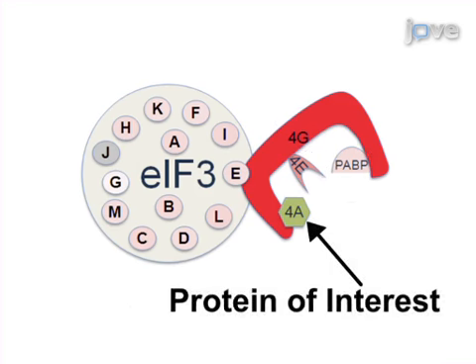The main advantage of this technique over existing methods such as tap tagging is that it removes the need for the investigator to send away individual bands for mass spectrometry. This removes an important source of bias whilst increasing sensitivity.